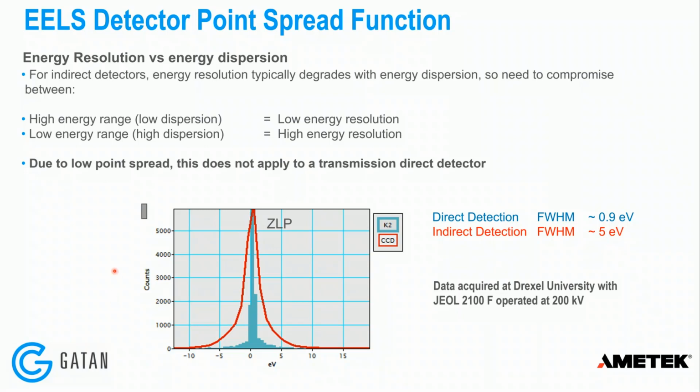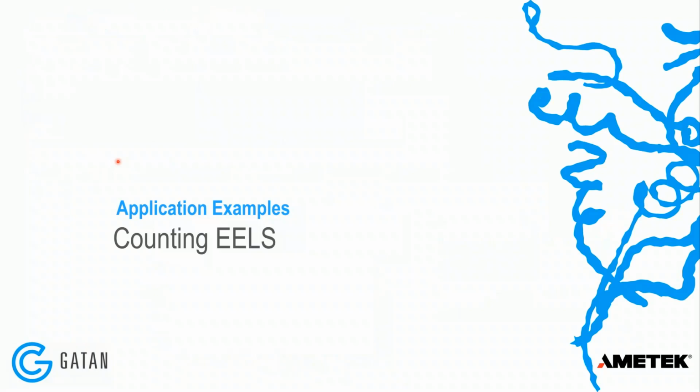So we can maintain energy resolution whilst keeping field of view. We don't need to make this compromise. That's super useful. Let's move on to the application examples for EELS.